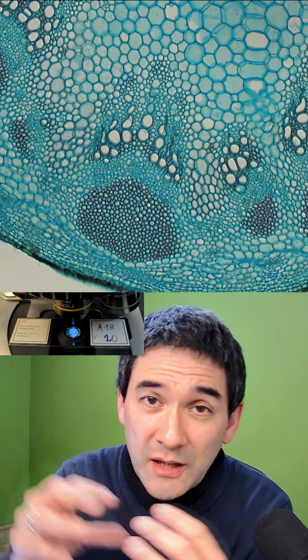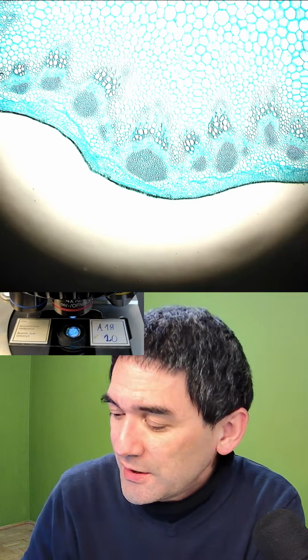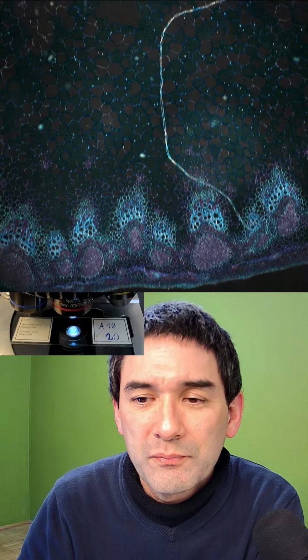And a sunflower, being a dicot plant as well, also has those vascular tissues towards the outside. So if the outside becomes damaged, the plant cannot transport the substances easily anymore. So this is also one of those nice ones. Let me try how this looks here. And you see, this is again in dark field. Look, a little bit of dust and dirt here.